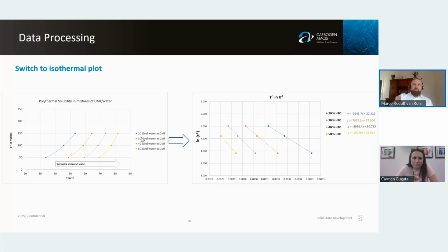So what we can do is cut away the workup section and say, okay, it is a validated process, so we leave away the workup. But if you want to change the reaction conditions, for example the solvent, the whole validation has to be repeated, and this barrier is too high. But I know other solvents were tested, but that's not something I can influence now.